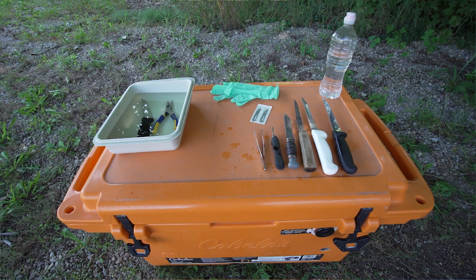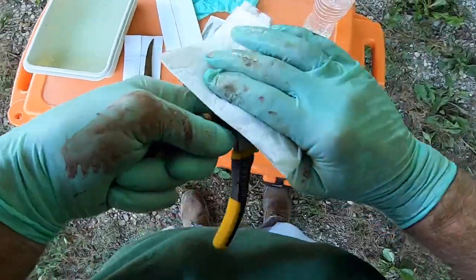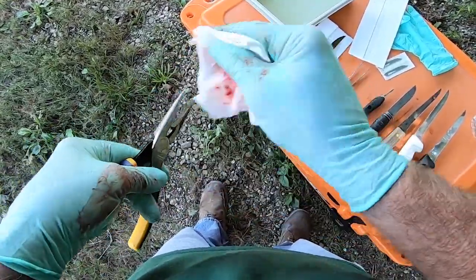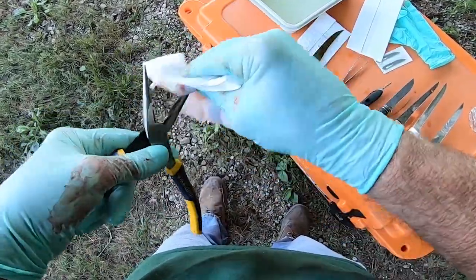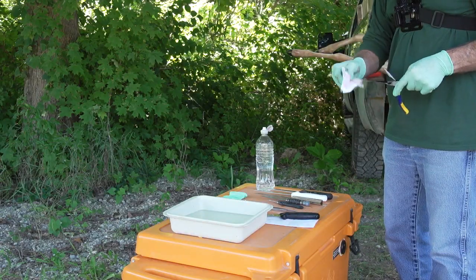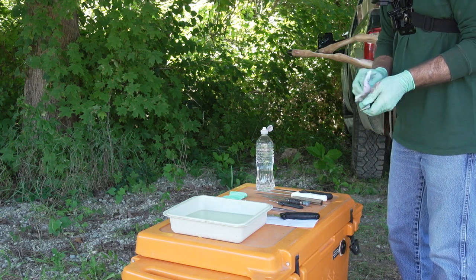If you are collecting samples from more than one deer, we recommend changing gloves and disinfecting tools between deer. Remove any blood, tissue, or hair from your tools and any surface that needs to be disinfected by wiping them off with a paper towel and rinsing with water. A mild detergent like dish soap can help remove dried blood or tissue but will not properly disinfect your tools.